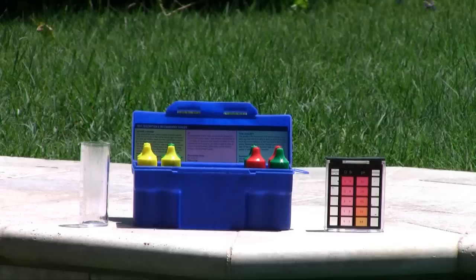Test kits use reagents to react with a sample of your pool water to give you a reading on your pool's pH, total alkalinity, and sanitizer, like chlorine or bromine. We recommend the DPD Deluxe Test Kit from Taylor — it's the perfect test kit for people who want to test their water at home.